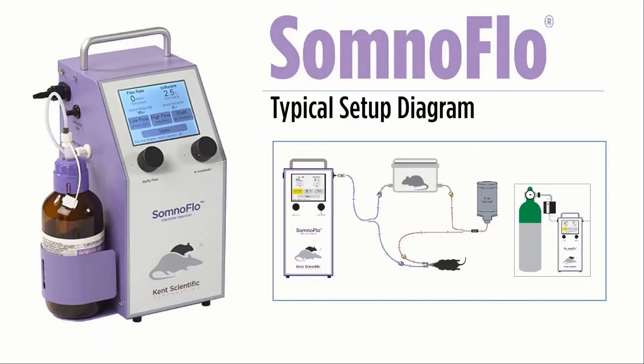If you select to use a compressed gas source, this can be easily done by selecting compressed gas on your SomnoFlow's touch screen menu. It's important to note that the PSI entering the SomnoFlow cannot exceed 15.